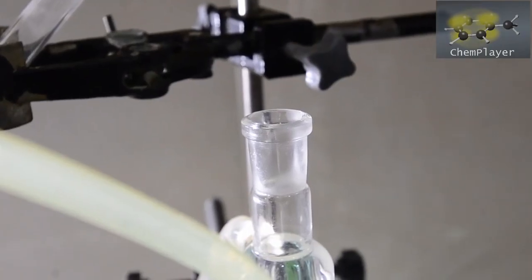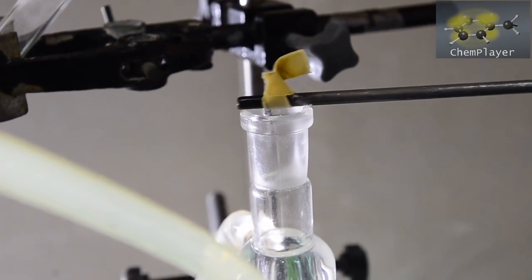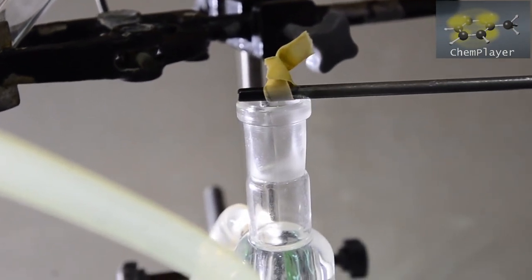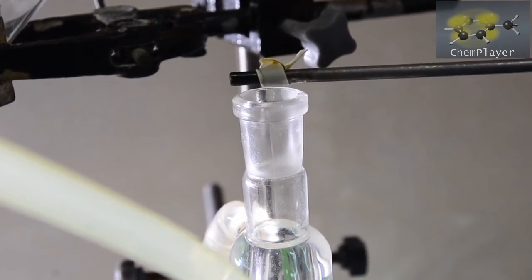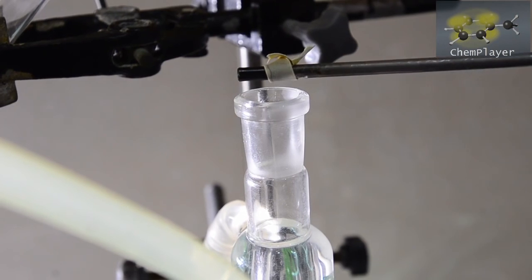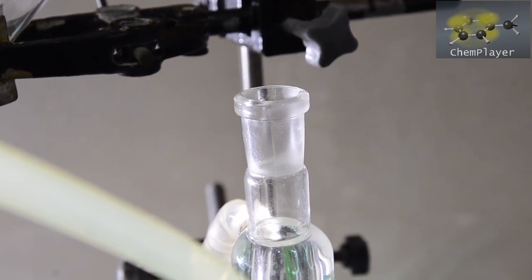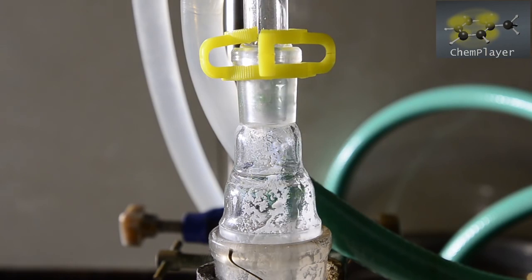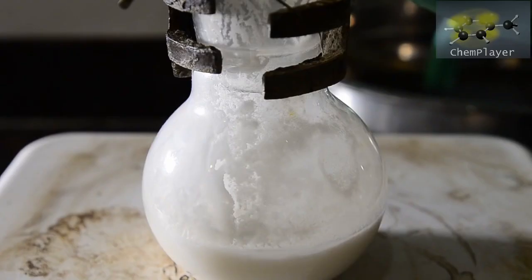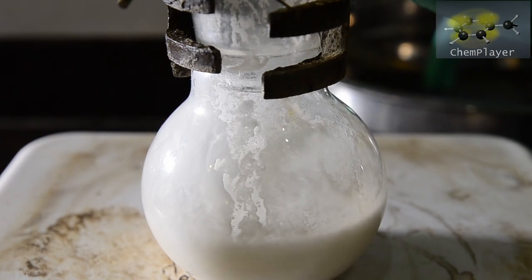2 hours are now up, and we've removed the drying tube from the condenser. As you can see from the indicator paper, there's an alkaline reaction from the vapor. This is due to a small amount of ammonia being formed in the mixture as a result of urea hydrolyzing under the alkaline conditions. However, there's not much. Now we add the warm water to the flask through the condenser. There's no obvious reaction or heat evolution.